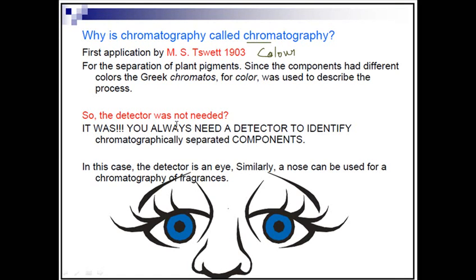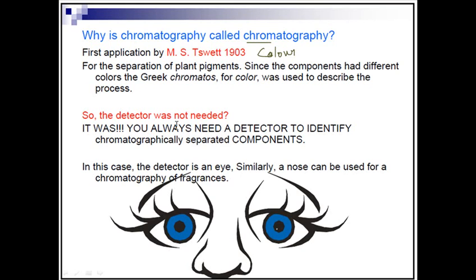If we close our eyes, we can still tell which food we are eating, but with our eyes open we can tell exactly, or confirm, the right name of the food. Without the eyes, we can only guess. So running this chromatography is not the end. We need to observe the data, feed it into the monitor screen, and finally have a diagram. By comparing this chromatogram with a standardized chromatogram, we can tell which sample mixture we are dealing with.